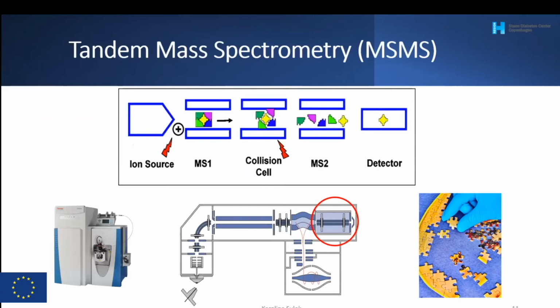The concept of mass spectrometry is very closely related to tandem mass spectrometry, which I would call MSMS. The idea is that one mass to charge can correspond to many different structures, so you have to figure out what the real structure is and not just the mass. We use a collision for this, and this is MSMS.